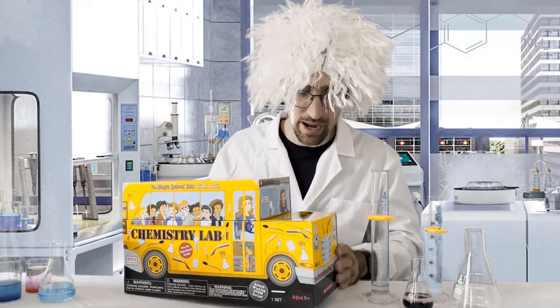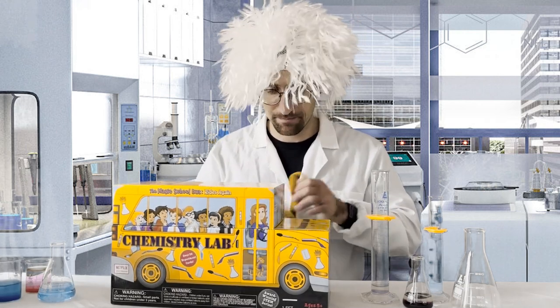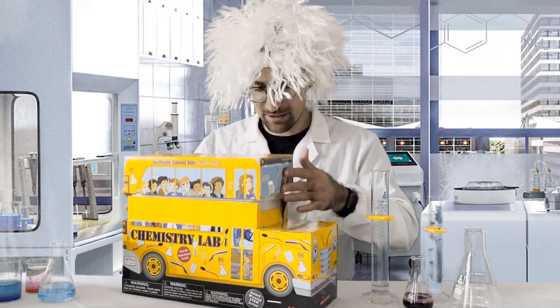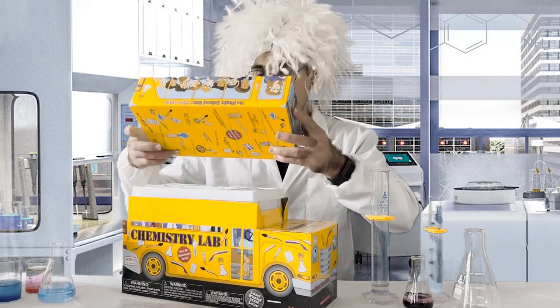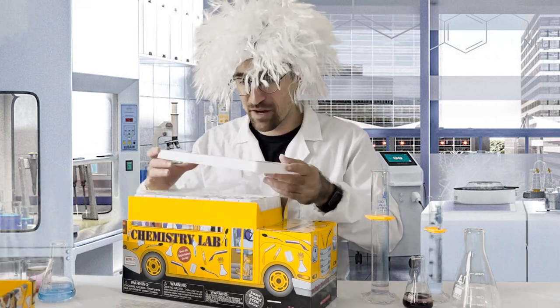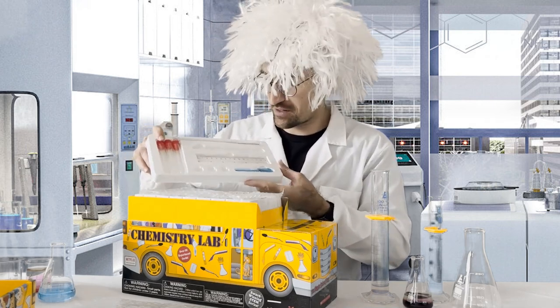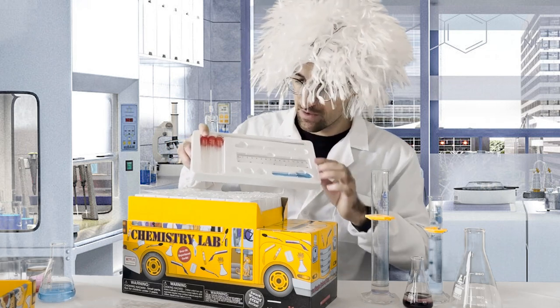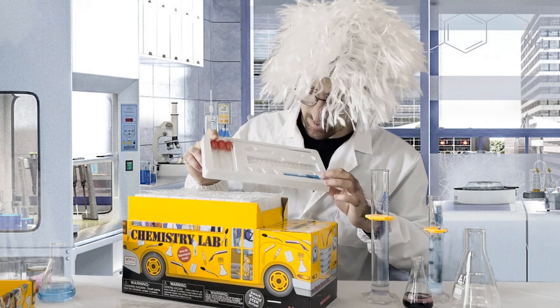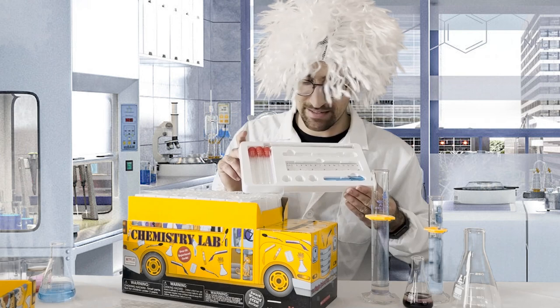Let's go ahead and unbox this. It's a series of boxes — let's see what's inside. The first thing we're going to do is lift this top lid, which acts as one of the first storage containers. It has some very nicely packaged material: you can see there are three little test tubes, a test tube cleaner, a little ruler, a pipette, and a pen.